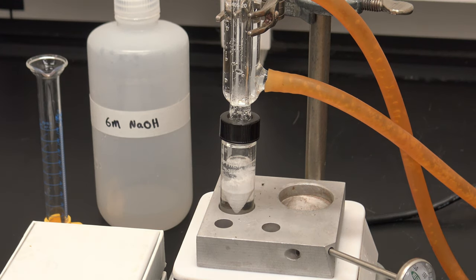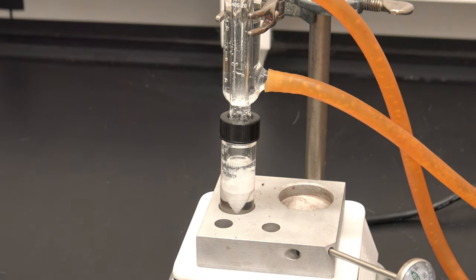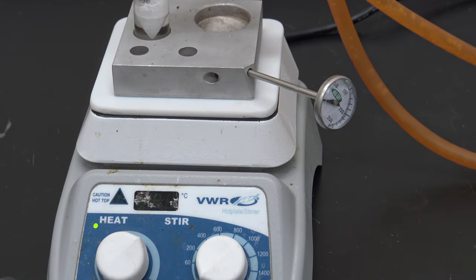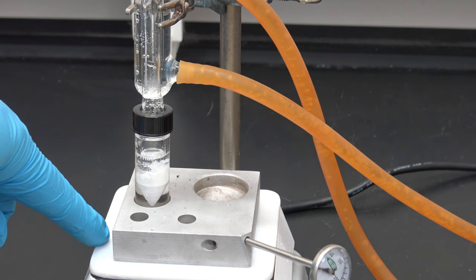Now I'm going to turn on the hot plate. I'm going to turn the hot plate setting up to approximately 300 degrees. You can see that value down there. It's blinking 300.